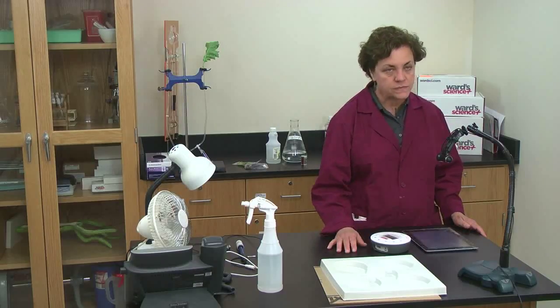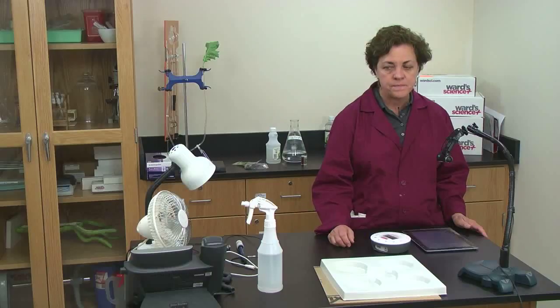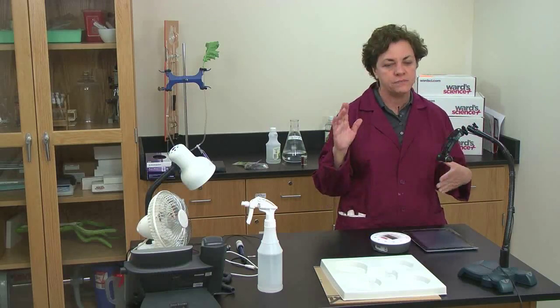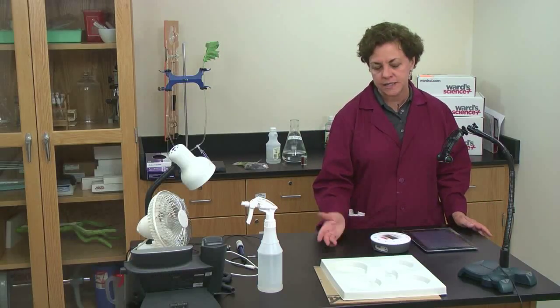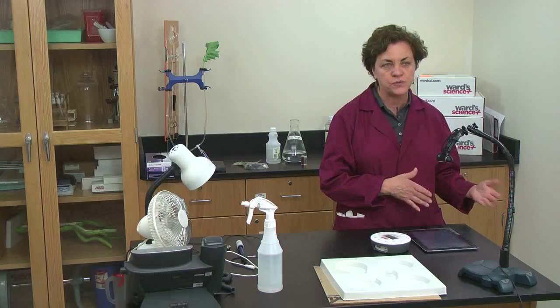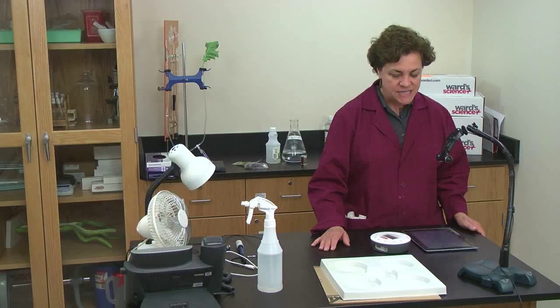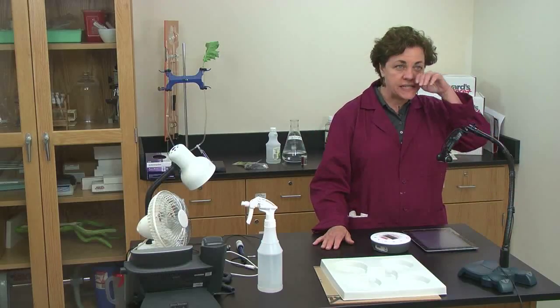I've listed here the easy way that things get started on the Datahub. The information that comes with the Datahub has what button to push and what time to push, not only in words but also in visuals, little pictures, which I always find easier to follow. Turn on your Datahub and launch the app, which I've already done here.